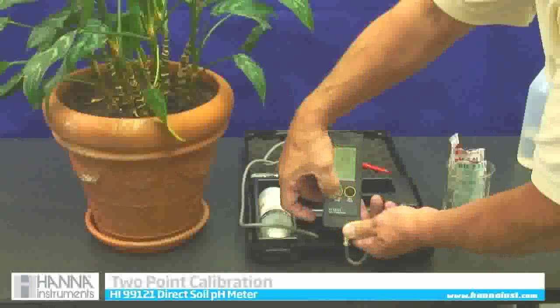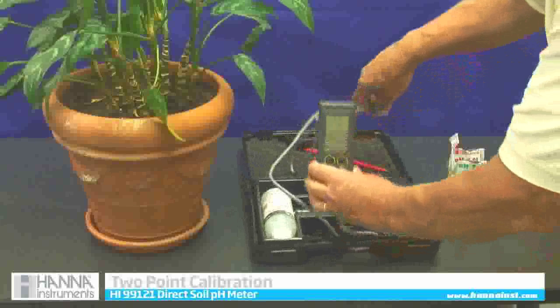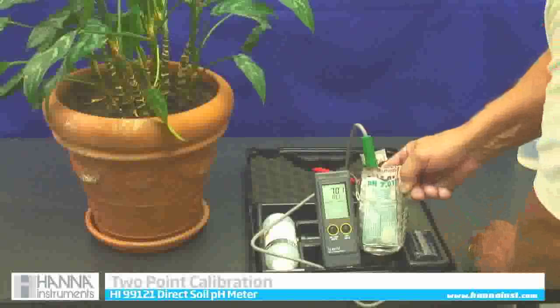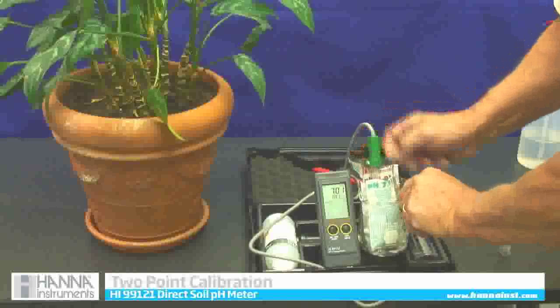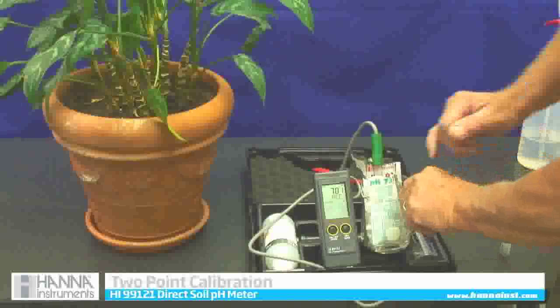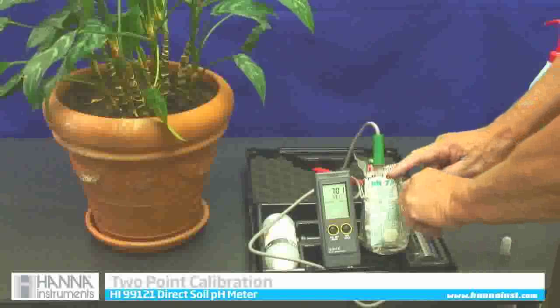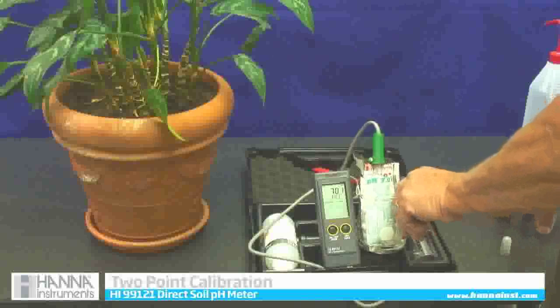It's depressed and there's calibration. Now I am going to do what it tells me to do — it says use 7.01. So I am going to put my meter into 7.01 solution and swirl it around a little bit. The REC means that it has recognized the 7.01. There is a flashing calibrated symbol on the lower right-hand corner of the screen, meaning it is actually calibrating itself to this standard.